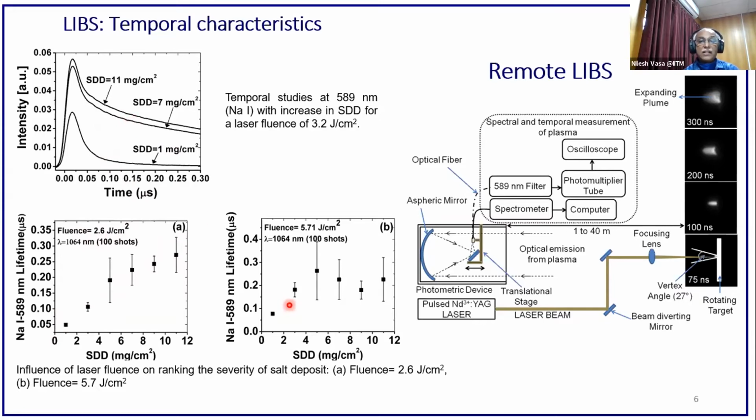We also verified that when we increase the laser fluence in order to ablate the material, and it goes beyond a particular laser fluence, then what we observed was a very large variation in the salt deposit concentration, as you can see here.